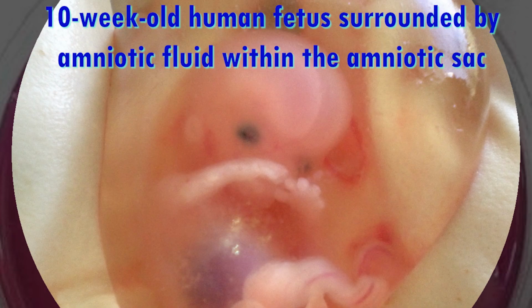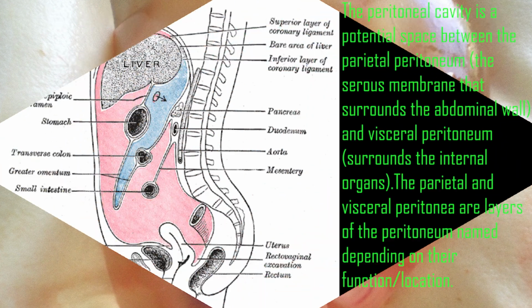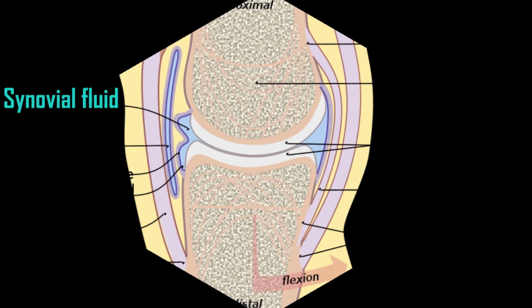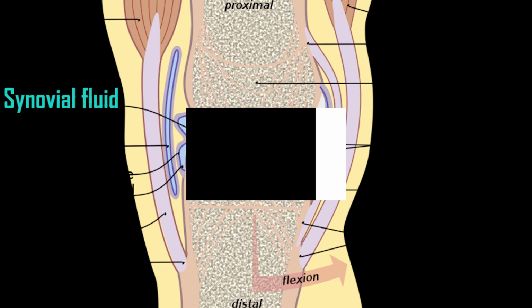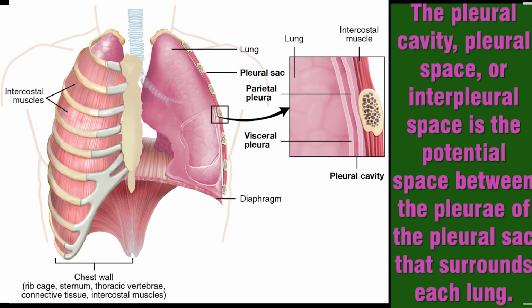Body fluids: amniotic, abdominal, peritoneal, ascites, bile, synovial fluid, pericardial fluid, pleural fluid. We can use anaerobic and aerobic blood culture bottles. Gram stain is done for all these samples. Blood agar, chocolate agar, MacConkey's agar, and thioglycolate medium are used for inoculation.